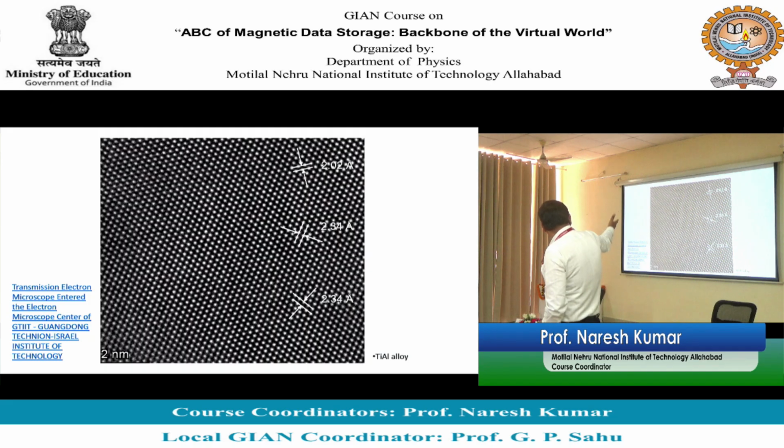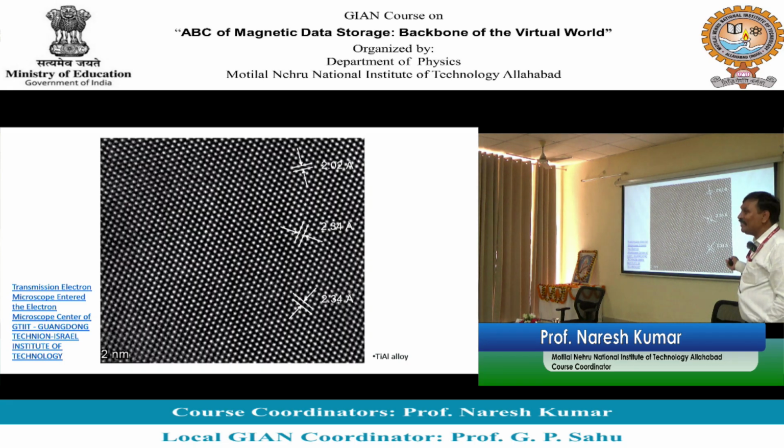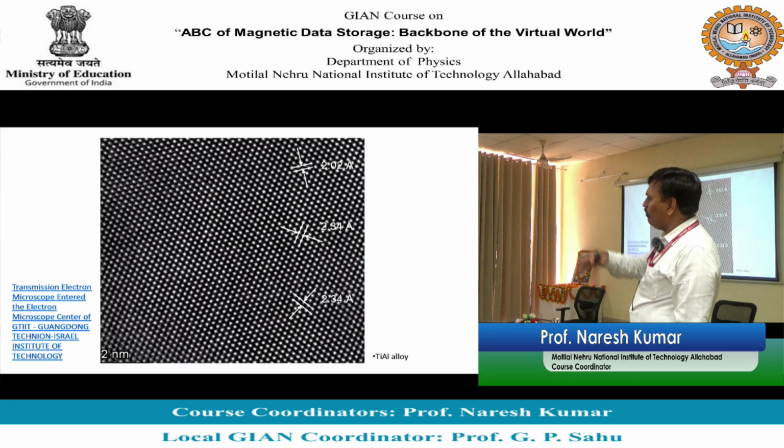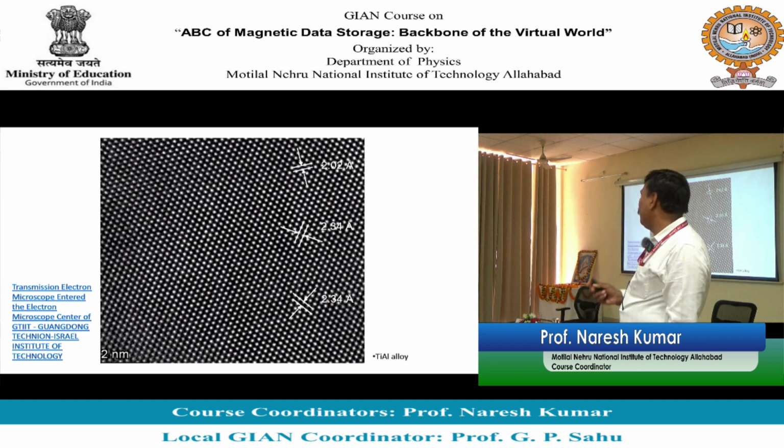So I am showing you this kind of some real data where my atoms are arranged. See how nicely they are arranged. It's a TEM picture, है ना? How nicely my atoms are arranged. See the discipline. देखिए जो हम लोग हैं और जो nature है बहुत अजीब है. Nature is so disciplined. कोई भी macroscopic से नीचे चले जाइए, so nicely. इसमें मैं थोड़ा भी change करूंगा, property बदल जाएगी. Any small change if I try to make, its property will change.